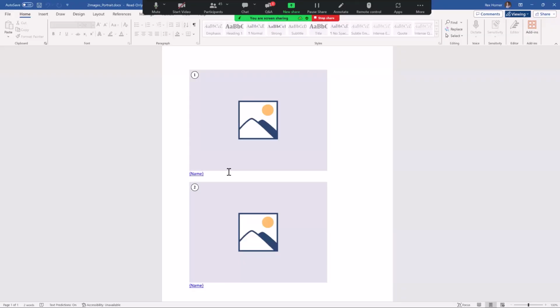the magnification that it was taken at, the resolution, everything, even the exposure time of the camera can be a field that you type in down here and save it as part of your template. And as soon as the image is loaded in, it pre-populates all those fields underneath of it. So it can pre-populate all the information for you. That's cool. The benefit of using the templates, and they're as simple as modifying them in Microsoft Word or Excel, or we even have the PowerPoint templates.